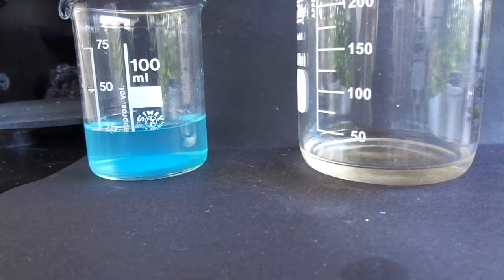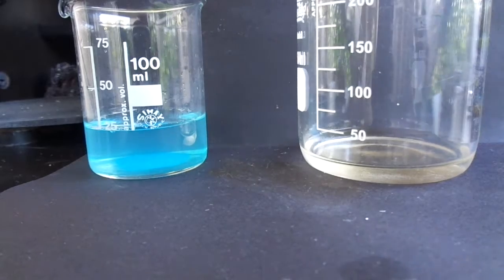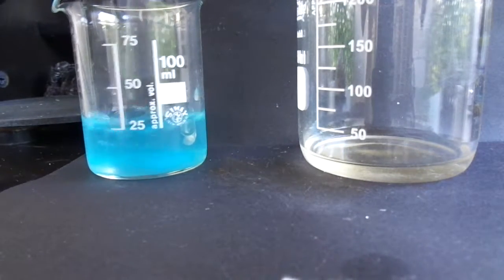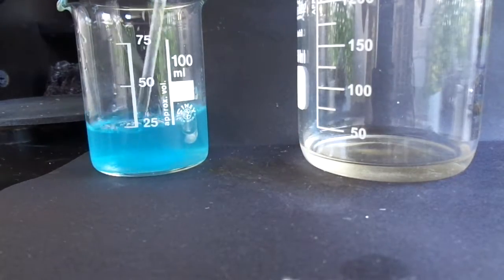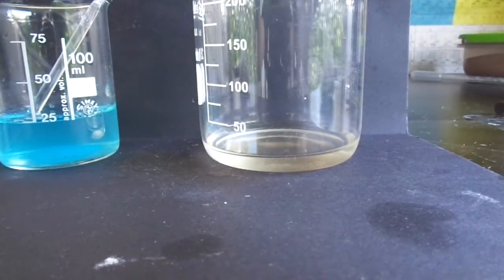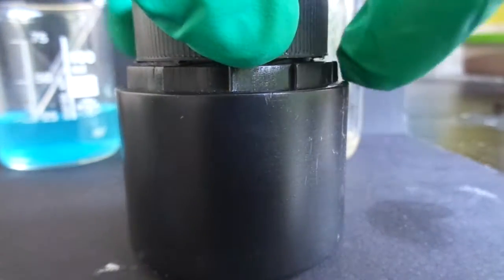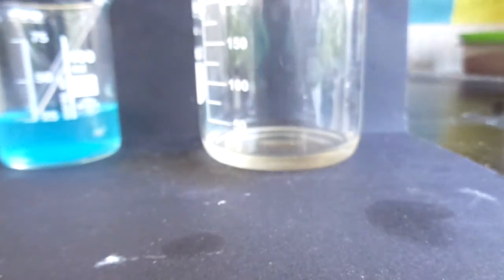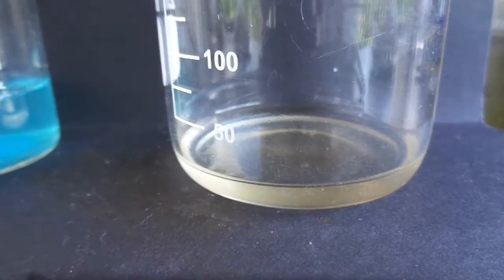Now I'm going to try to make some copper cyanurate, which is supposedly a nice violet compound that is insoluble in water. I've got some copper sulfate solution here on the left and on the right I've got some sodium hydroxide solution.